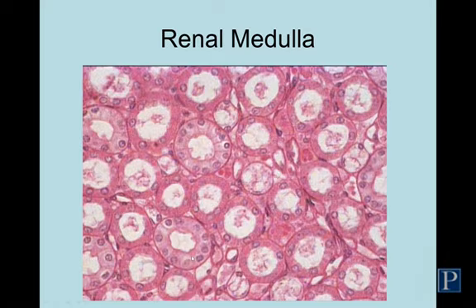Here's another collecting tubule. Here's another one over here. And here's another one over here. And you can see part of one sticking out here as well.